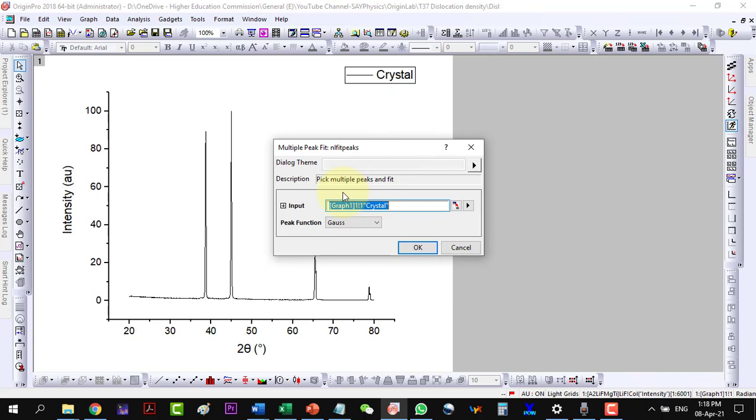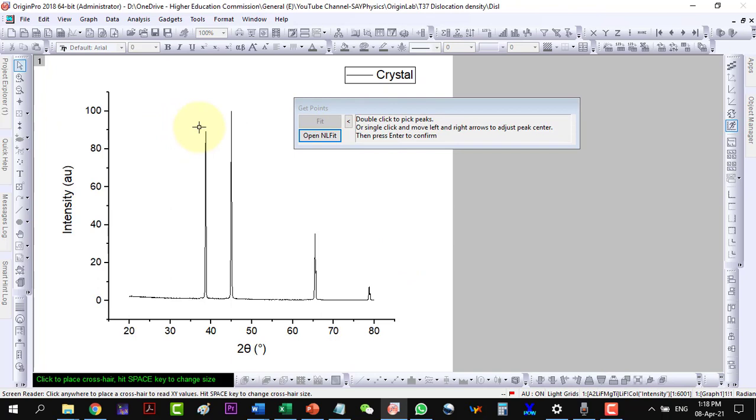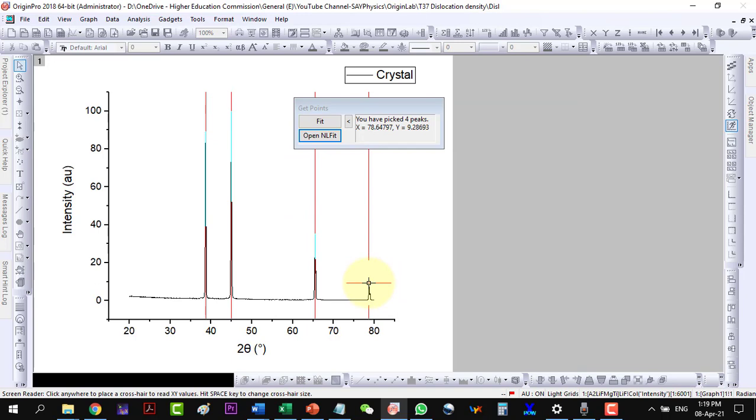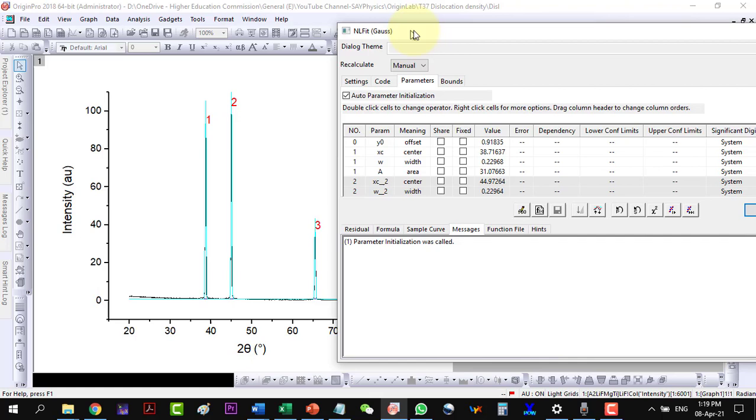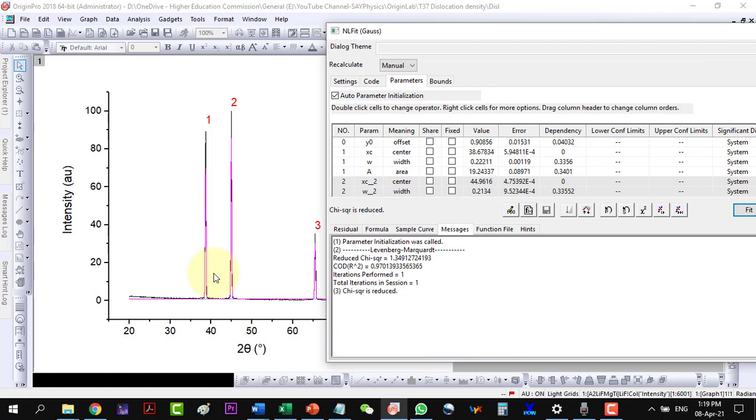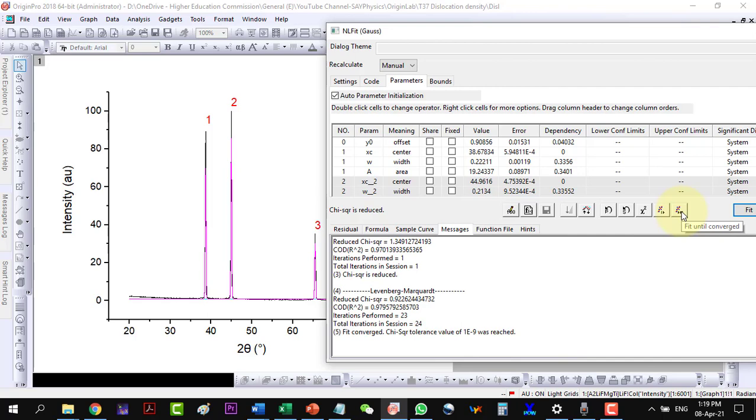Pick the peaks by selecting with a double click. Open the non-linear fit. Click one iteration to see everything is good, and then fit until converge. It will fit all the peaks. Click OK.